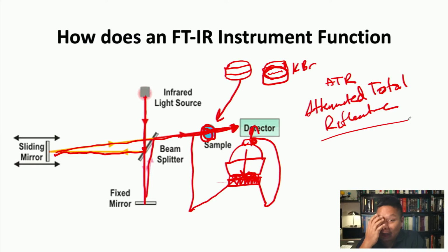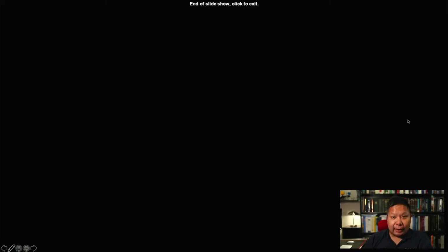So for this lab, I think that's actually the last slide. It is. For this lab, you'll be getting IR. The video is actually very good, and it will go through the basics of using IR spectroscopy to identify functional groups, and you'll be getting some IR data, like spectra, and you'll be using that to identify certain molecules.